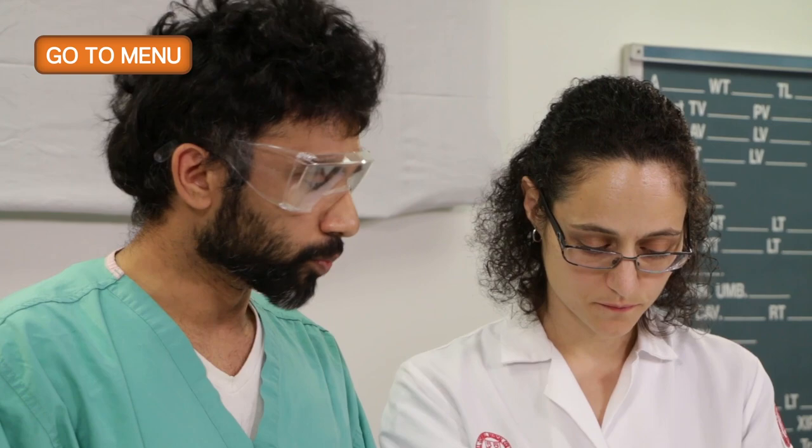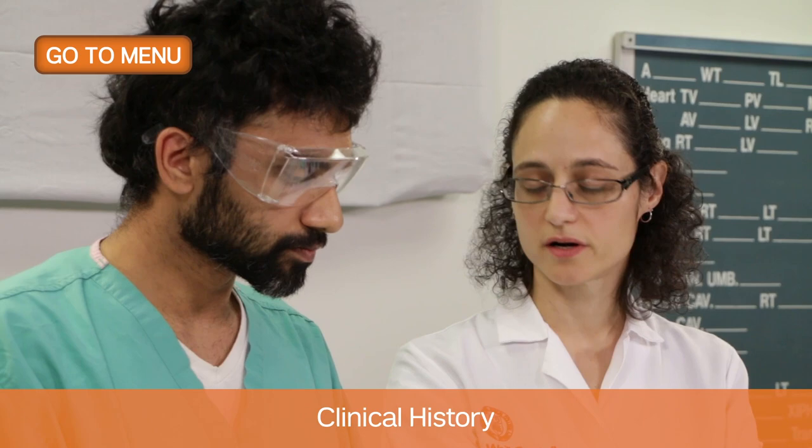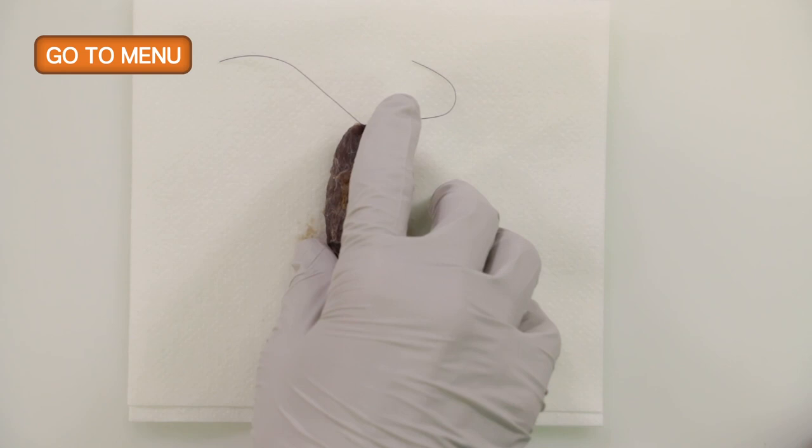So what else should we know about these thyroid specimens before we start grossing? Before you ever start grossing a thyroid specimen, whether it's a lobectomy, a hemithyroidectomy like this, or a total thyroidectomy, you want to know what the preoperative findings were. In general, almost every thyroid has been FNA'd before it's been removed, so there's usually a fine needle aspiration. You'd like to know, especially if there are multiple nodules, which nodules have been FNA'd, so you want to direct your grossing towards those specific nodules.